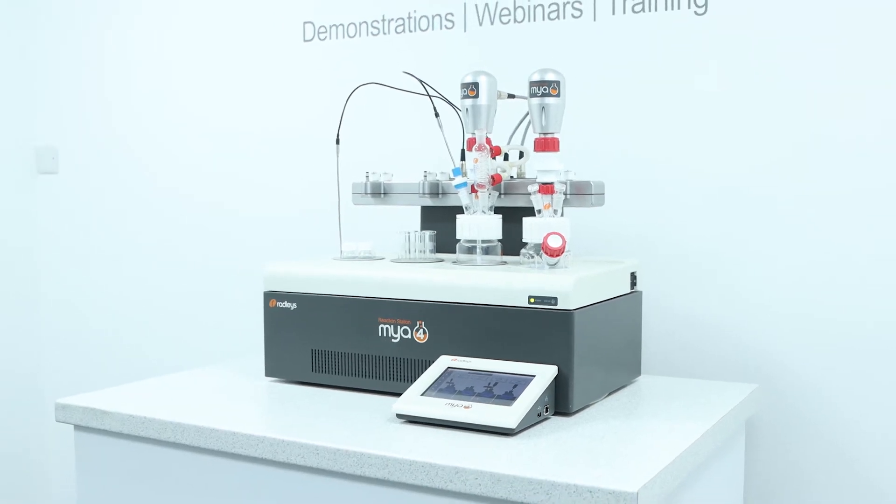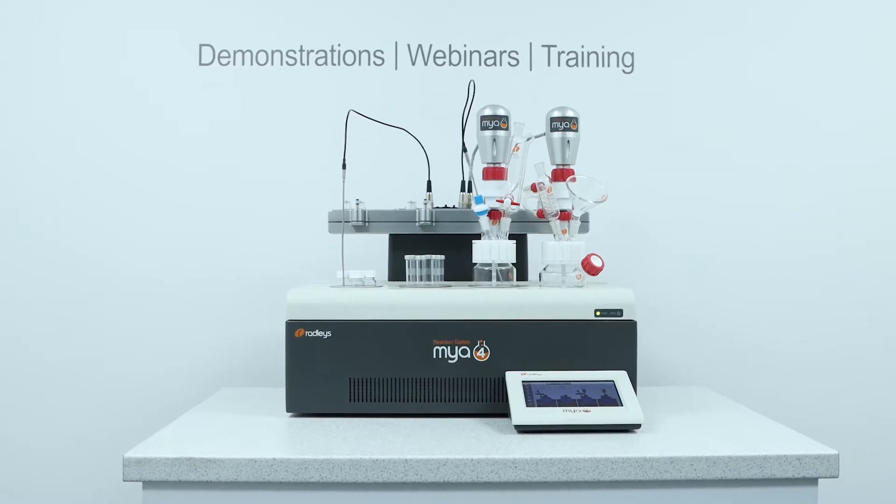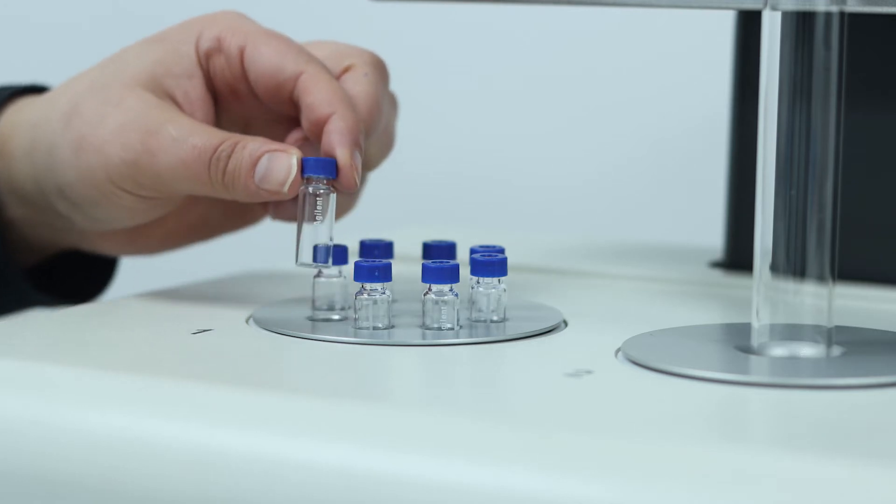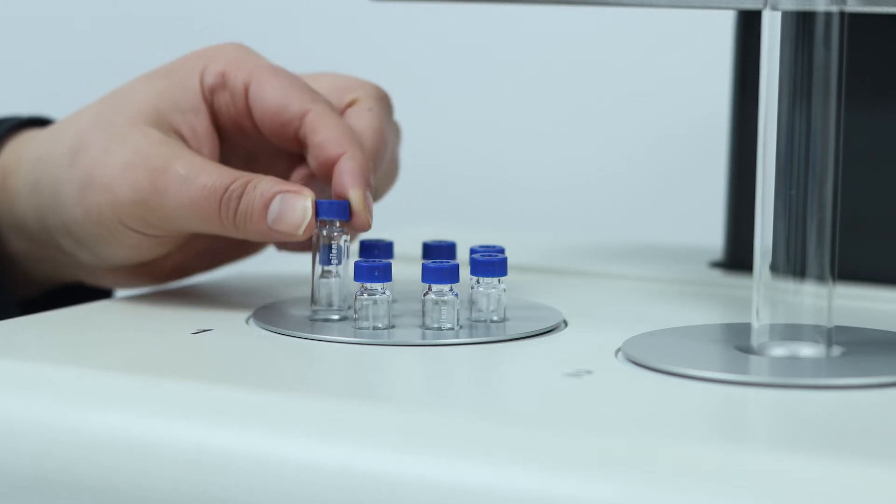The Maya IV reaction station accommodates a wide range of glassware, including a variety of tubes and vials, such as HPLC vials.